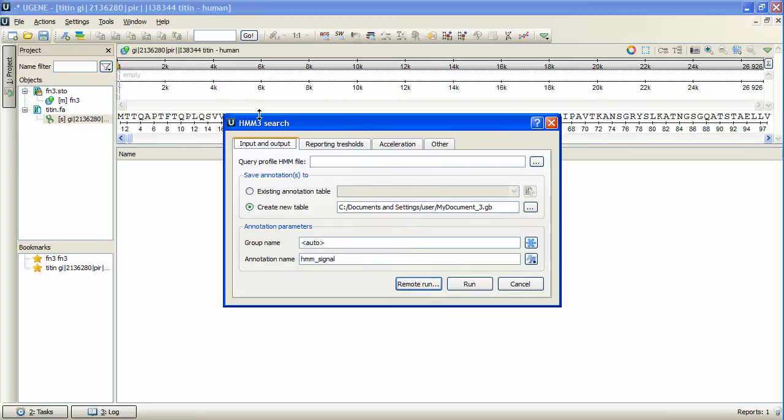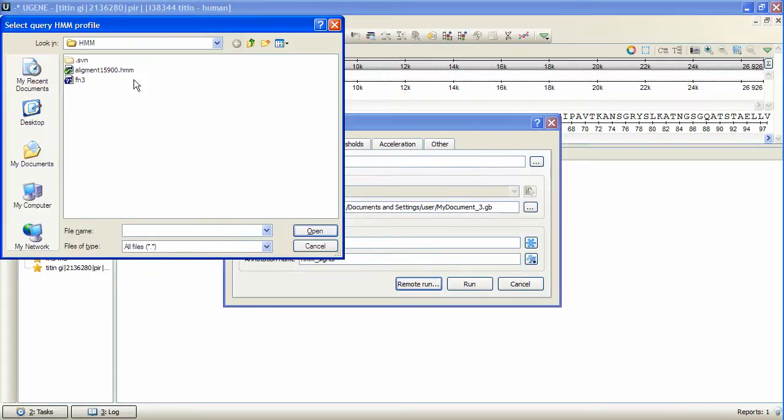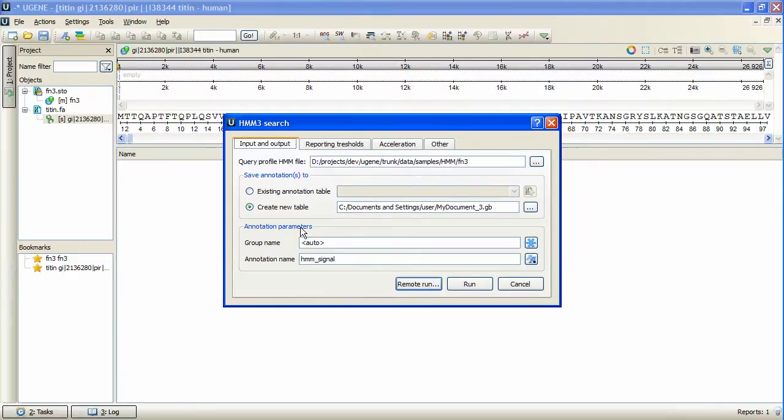In the first tab of the opened dialog box we specify the profile HMM file we've built to search with. We will search for homologically related domains of the opened sequence, which are called HMM signals.